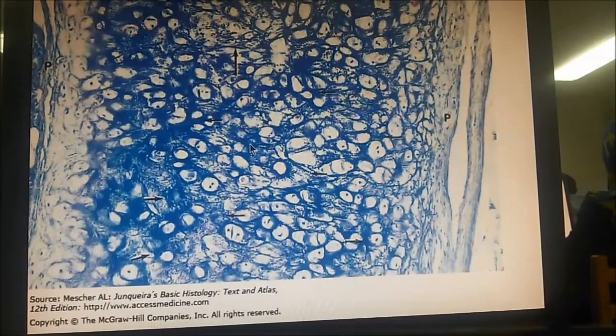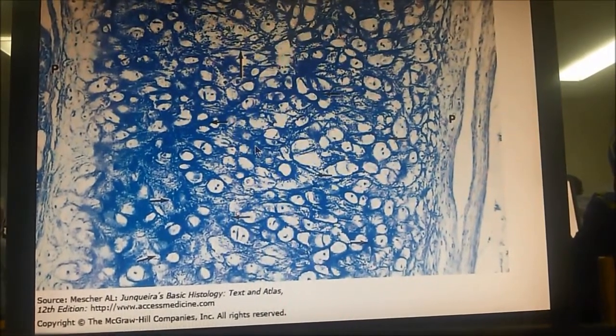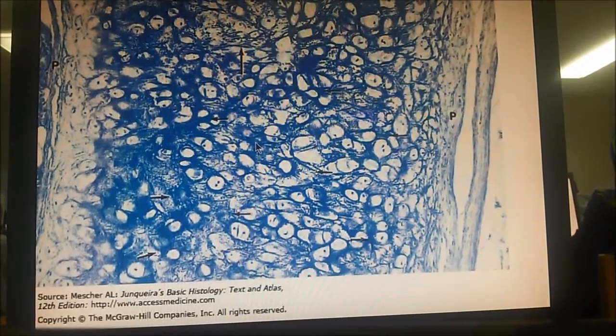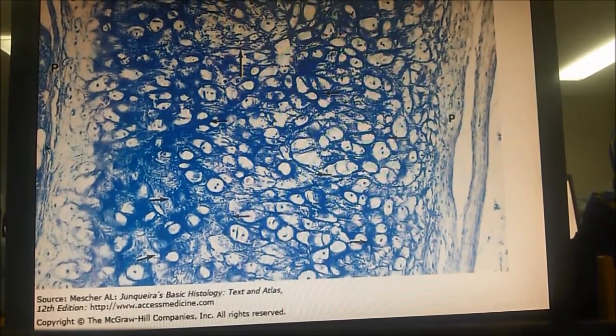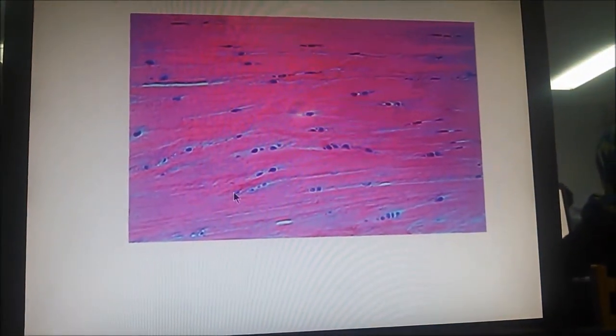هنا chondrocytes different staining mechanism. This is the blue Orcein. برضه شو dark ولا light? Darker matrix that contain fibers definitely an elastic cartilage. Will be هم البيريكوندريوم on the both sides. هون طيب نيجي نطلع هون.